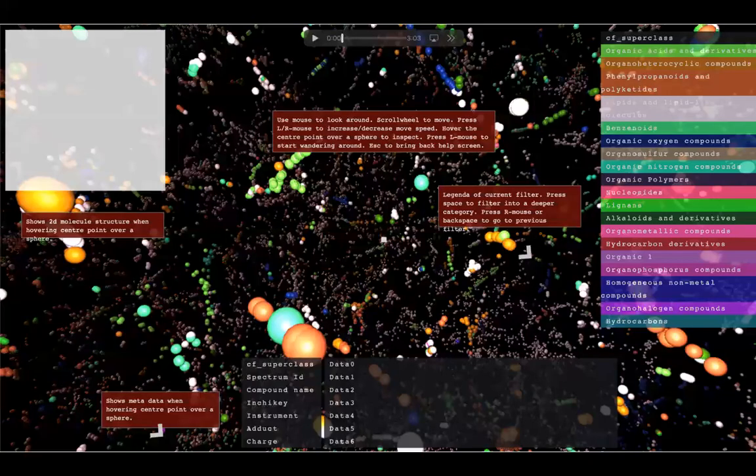And finally, I would like to share with you that we not only use these embeddings like we just did in the notebook to produce the UMAP plots for initial screening. I also use them during teaching with the students. Here you see not a 2D representation, but a 3D representation, and it was created by the Wonder Lab in Wageningen.